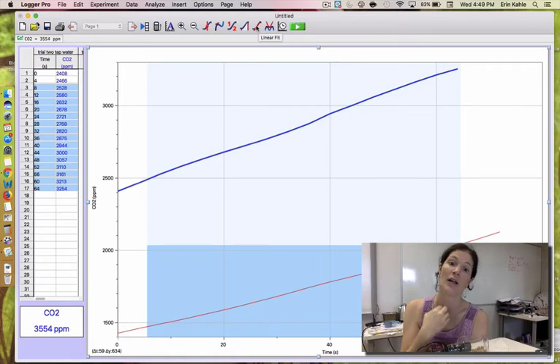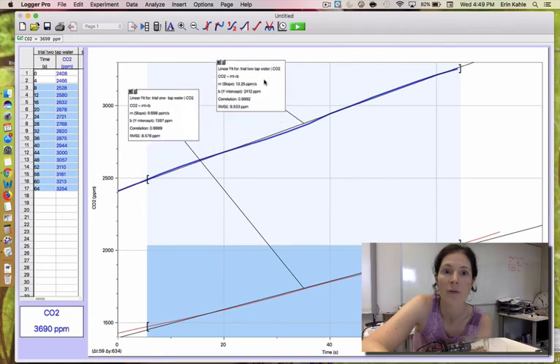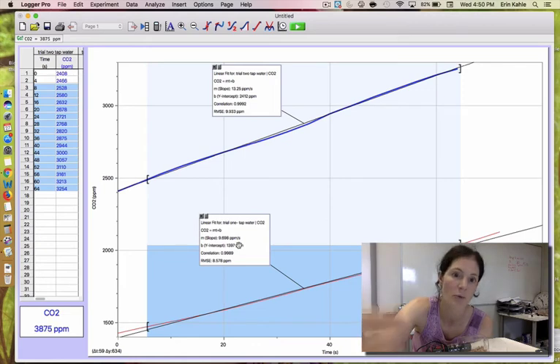So we said that the slope was our rate of cell respiration. And so we're going to find the equation for both of those lines. And the part that we care about is the slope. So for this one, it's interesting. The rate did change. At the beginning, it was 9.698 parts per million per second. So every second, we got 9.698 more parts per million of CO2. And then as it continued, it's interesting, the rate actually increased, that now we have 13 parts per million per second.